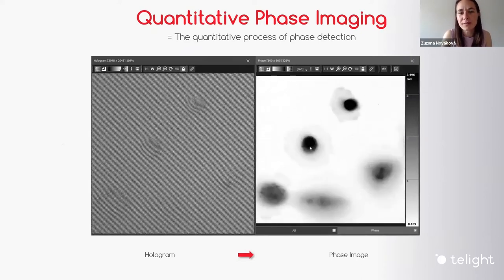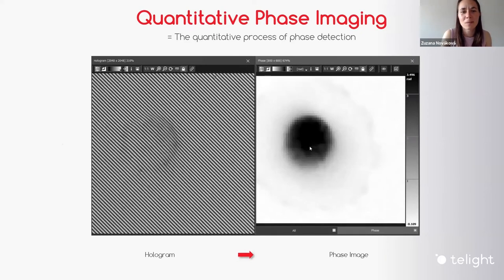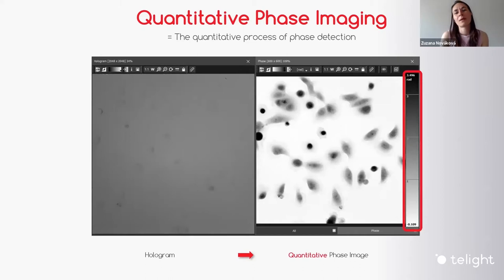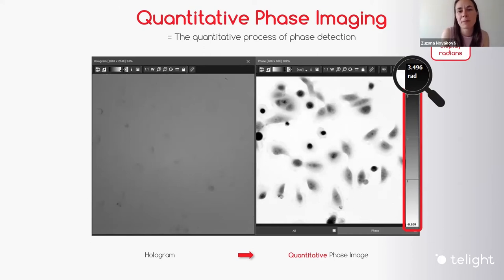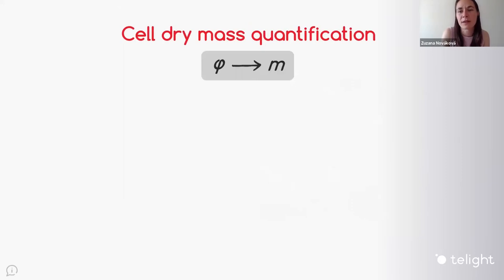When I zoom in to such an image, you can actually see that there is a cell on the right and interference fringes on the left. What makes this technology beautiful is that it's quantitative — each pixel of the phase image carries the information about the phase shift, how much the light was delayed when passing through the cells. So this is quantitative phase imaging: the process of detecting the quantitative phase of the transmitted light.